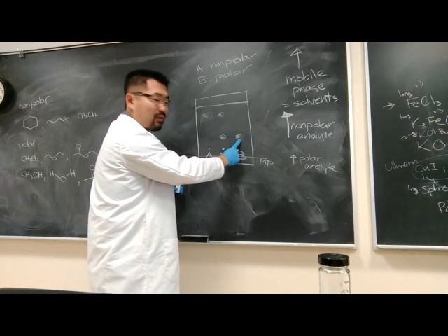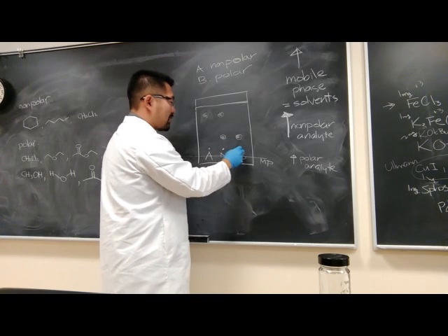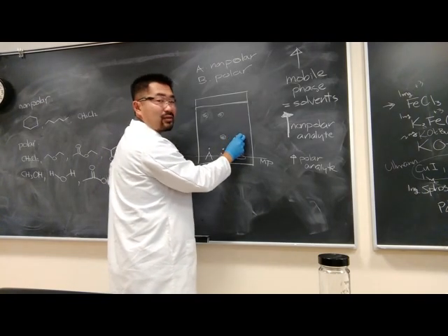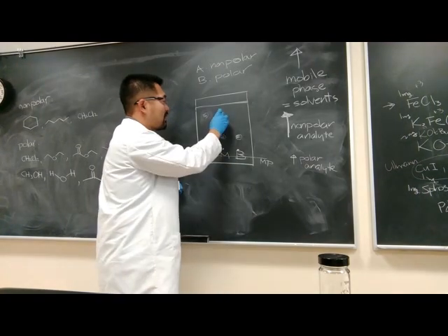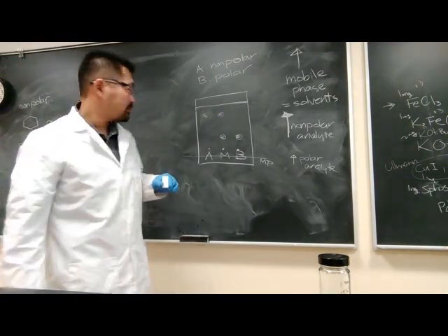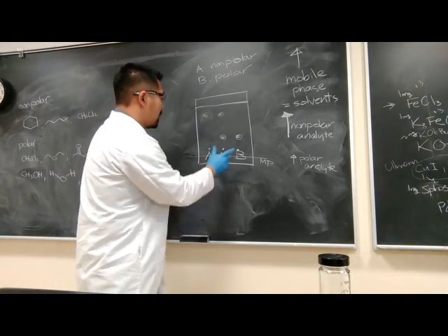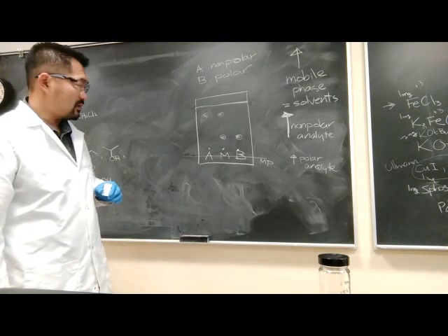It interacts with silica gel quite a bit, which slows down its traveling time, and so it doesn't travel as far on the TLC plate. In the mixture lane, you've got both A and B present in the same lane. And here we can see a good separation of the two samples.